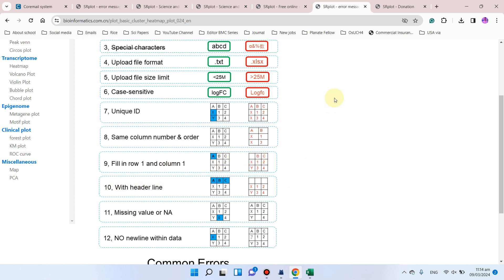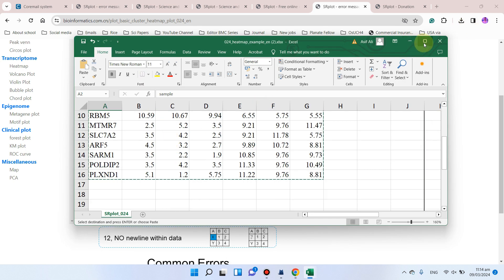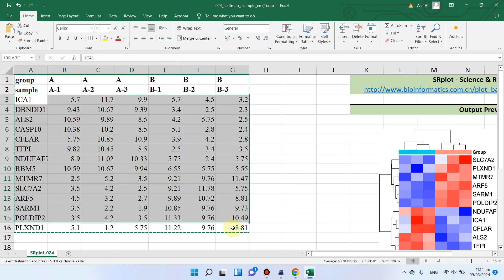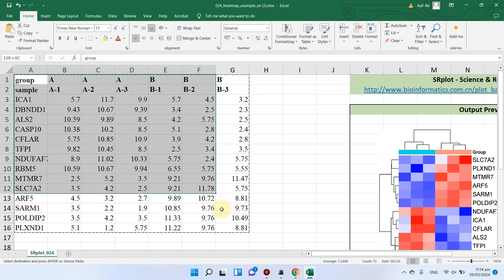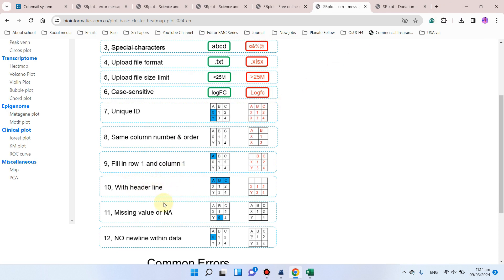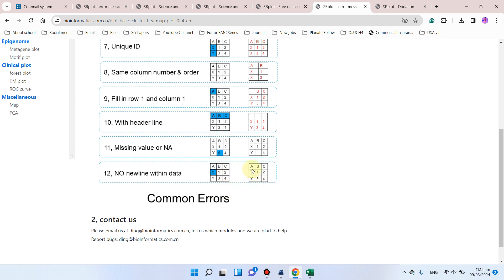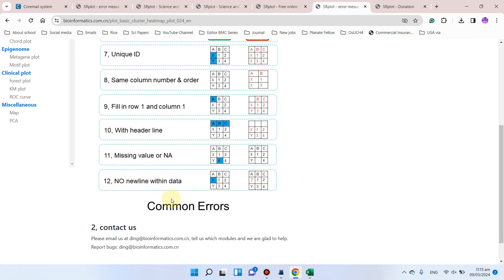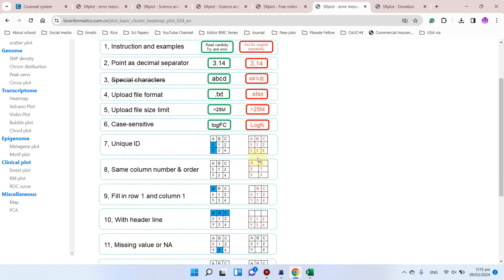Next, be careful with the header line. When copying data for a heatmap, you must also copy the header information along with the other data when pasting — do not forget the header line. Also, for missing values, you can write zero rather than leaving it blank, as blank missing values will cause an error. Finally, there should be no new line within the data — for example, if two words X and Y appear in the same cell instead of different lines, it will give an error.